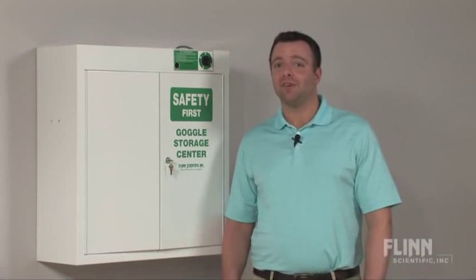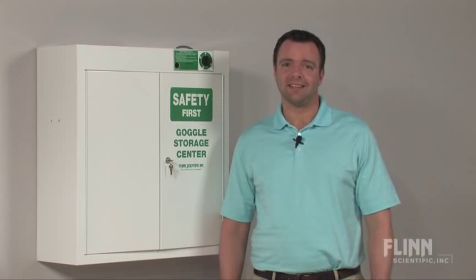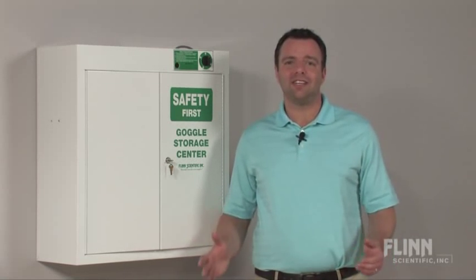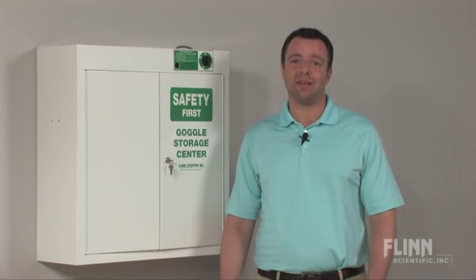Students come in and out of your lab every 45 minutes throughout the day. The question comes up: how am I going to disinfect all of these goggles in this little amount of time in between classes?